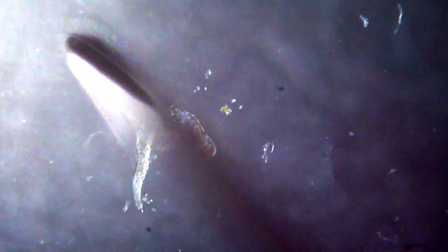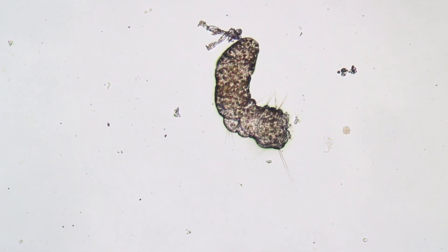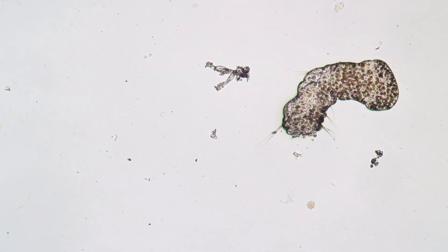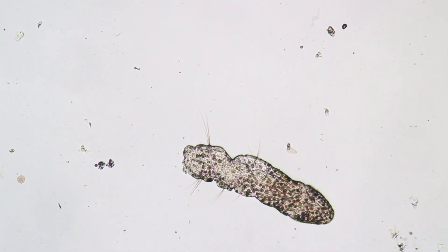Another try — cut, cut, cut — no, it didn't work. Another try, cut — and now it worked! Here is the head, it did work. So let's quickly change microscopes. This is now using my compound microscope, and you can see that the head simply continues to move as if nothing happened.